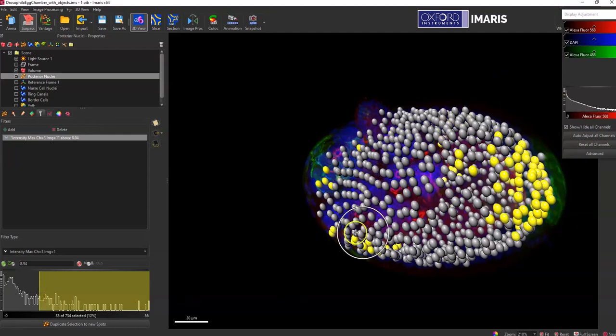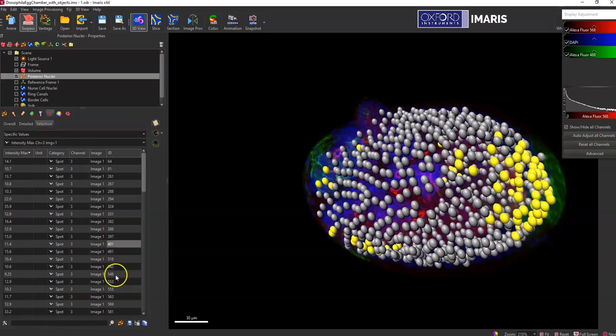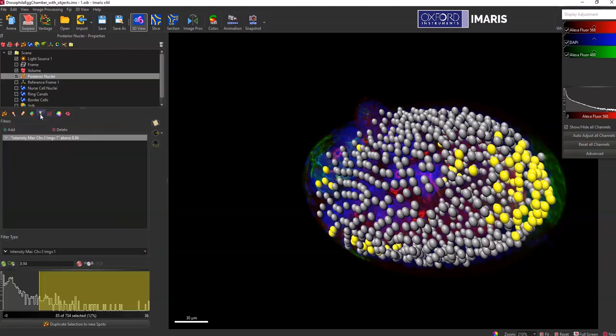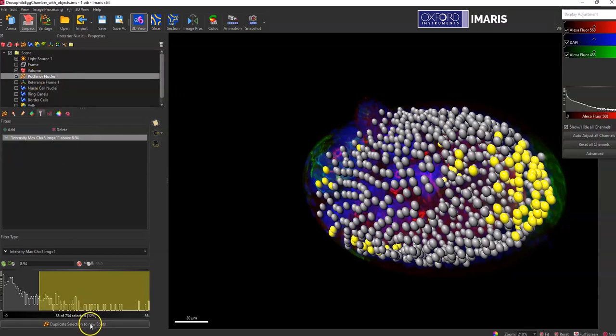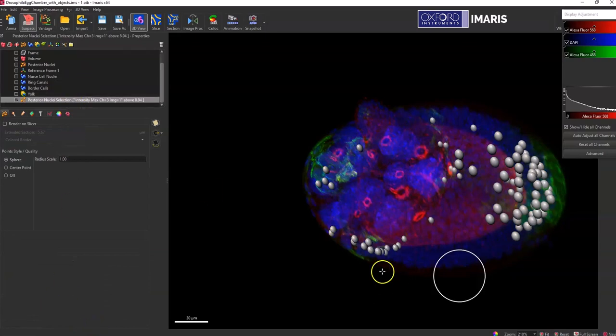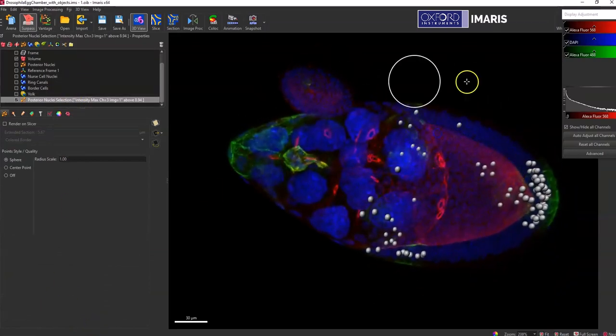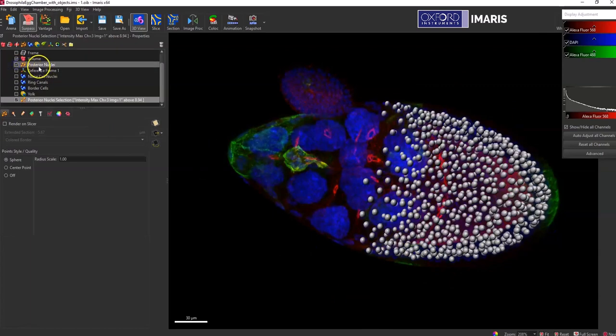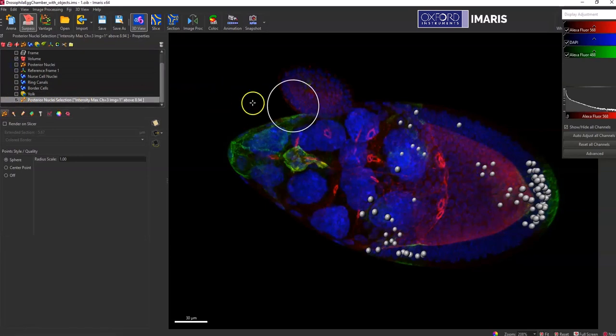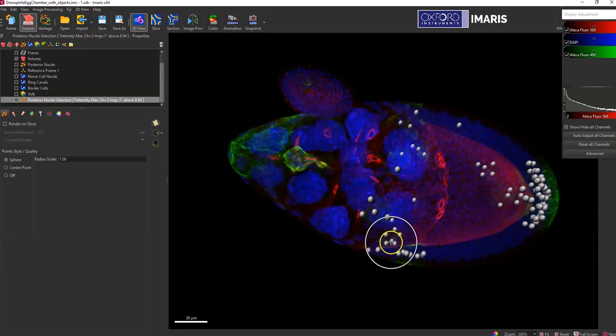I can go back to the statistics tab, and then in my selection, those are the ones that are highlighted there. I can also use this same filter tab to create a new subpopulation of the spots objects. I would just select this duplicate selection to new spots. And you can see that I have my population that were highlighted yellow in the original population, and it's now just in this new population of those ones that have that intensity max of channel three above a specific level.